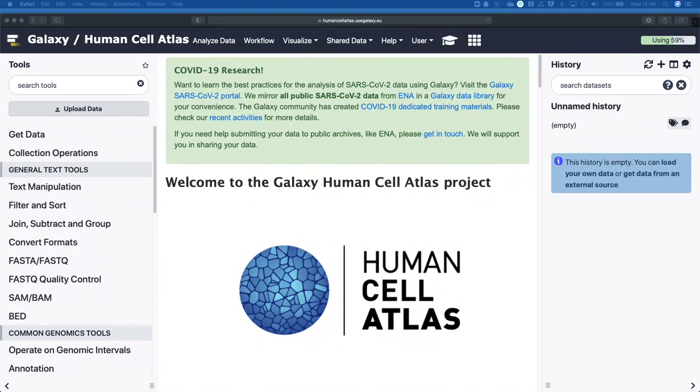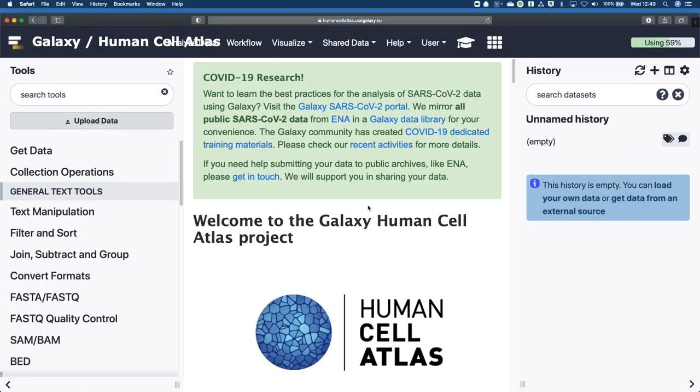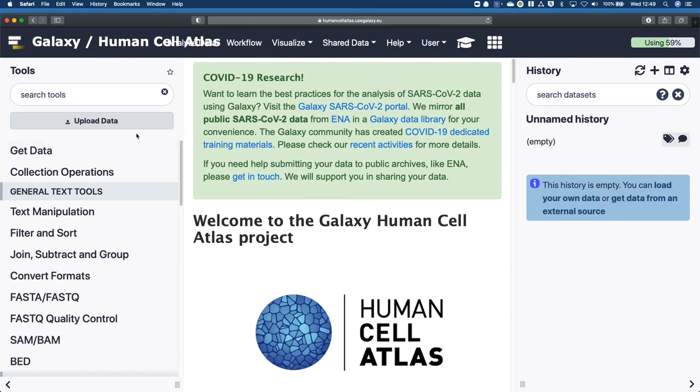Hello, my name is Wendy Bacon. I'm a lecturer at the Open University and I work with EMBL-EBI. This is going to be a tutorial on using Alevin to create a single cell expression matrix using single cell data, ideally from a droplet-based strategy. Some important points about this: I'm going to do this within the Human Cell Atlas Galaxy instance. This has all the same tools that are on the usegalaxy.eu instance, although they're just a little bit easier to find because it's set up for single cell in general. So you should be able to use any Galaxy instance you want in the European group.